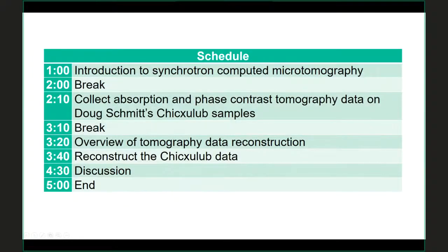So the schedule I sent to you: it's going to be roughly an hour talk that I'm going to give now. Then we'll have a 10-minute break or so. Then we'll go out to the beam line and show you the beam line, mount some samples. We'll come back here and Doug Schmitt, whose samples they are, will give a little talk about why he wants to measure these. And then we'll actually make measurements on one or more of those samples as time permits.